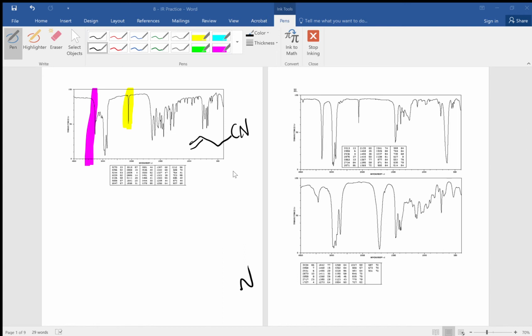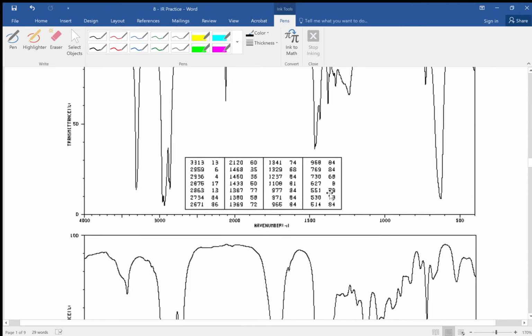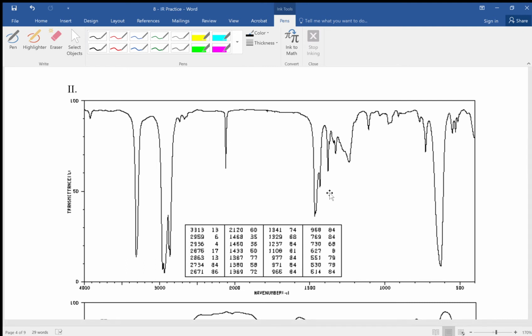So what I'm going to suggest, because it doesn't seem to be working the way I'd like it to, it's just the screen ends up being too small, is if you don't have your copy of this exercise out or open, you should do so, because I'm going to be referring to the compounds on that table, and that's the table at the bottom of page 6.